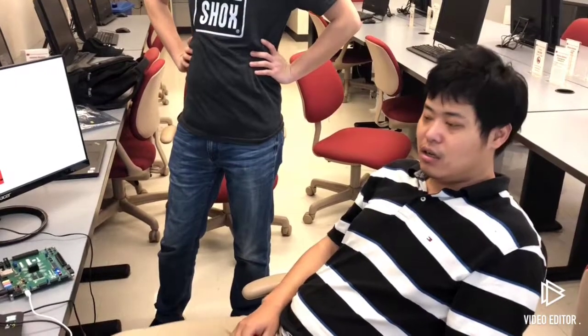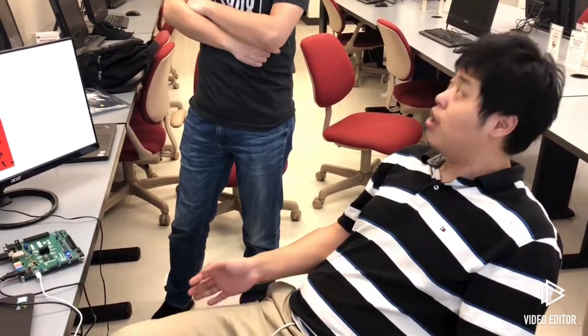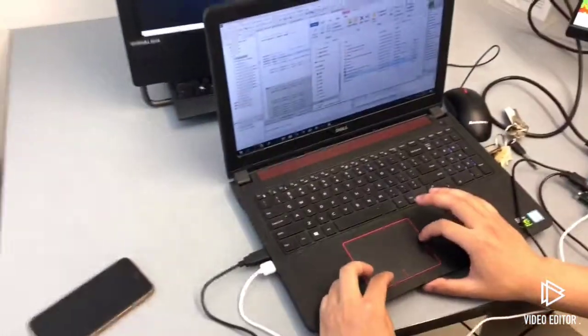Hello everyone, here is our EC551 final project, fluorescence microscope. Our group name is Glimmer. Here we show you the video of the demo.